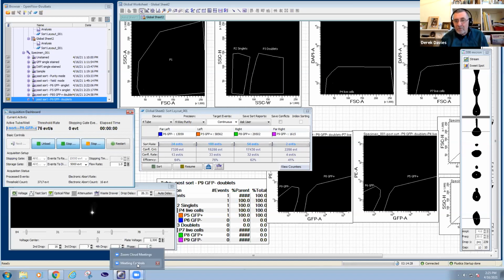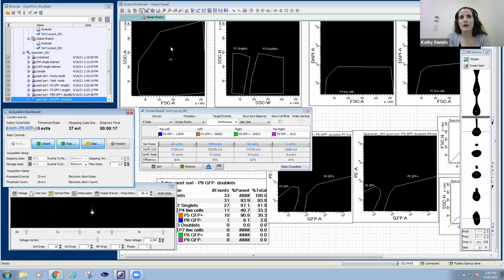So going forward, if you're taking that to some sort of molecular biology application and you're taking that whole population, yes, you do want to know how many of those cells were dead, and actually only 92% of the cells were live in that. So you need to take that into account. Yeah, I would completely agree.